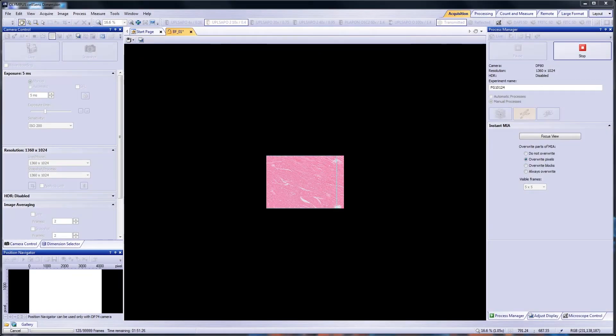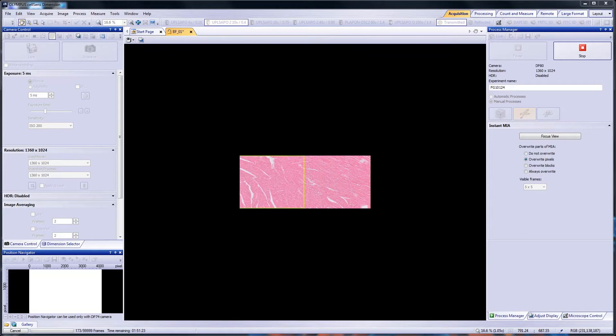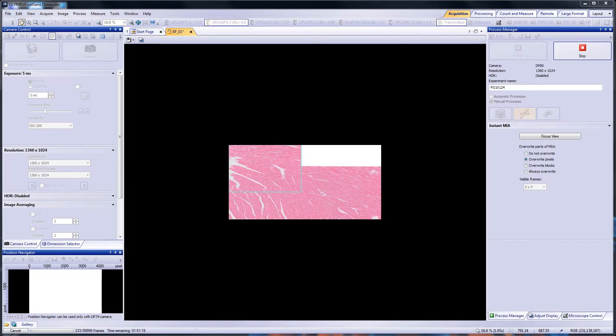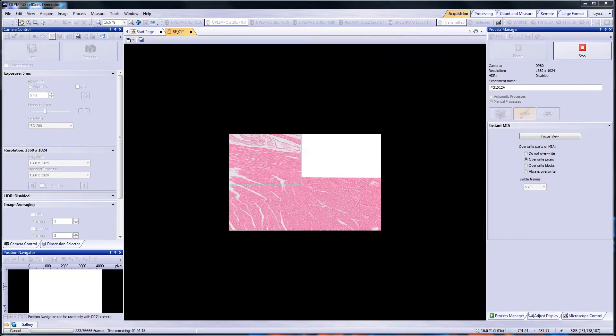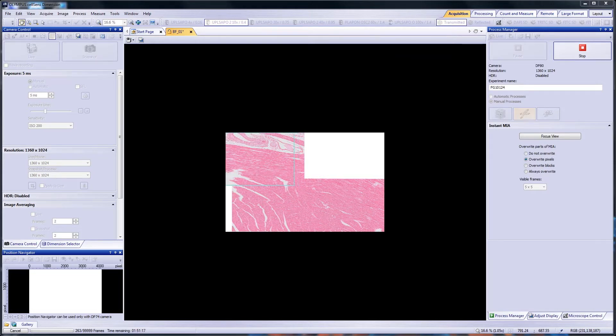With Instant MIA, the images you acquire are combined, like a puzzle, into a single stitched image, enabling you to see a sample area that is much larger than what can be acquired with a single snapshot.